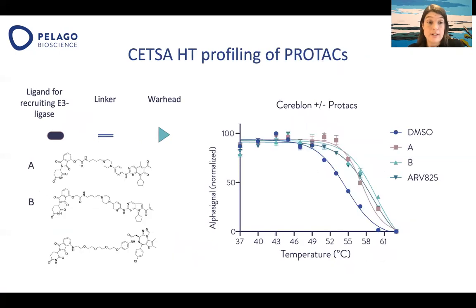Lastly, we have also done the same profiling of these PROTACs against the E3 ligase, cereblon, and in this study we also included a third compound, which is also based on the same E3 ligase, so binding to cereblon, but this is a BRD4 PROTAC. But all three PROTACs show target engagement versus cereblon in this case, and can be used for confirming that binding.